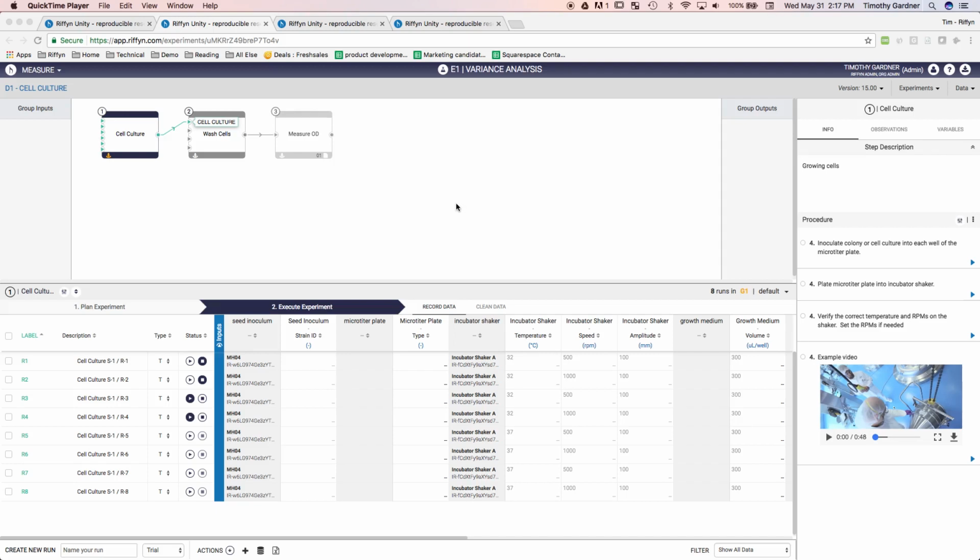Here we'll illustrate the use of Riffyn to query multiple experiments and/or processes at the same time from an external application. This is accomplished by interfacing that application with Riffyn through its programmable API. And in this example, I'm going to use JMP to pull the data tables on 3 different processes and experiments, actually 4 experiments on 3 different processes.